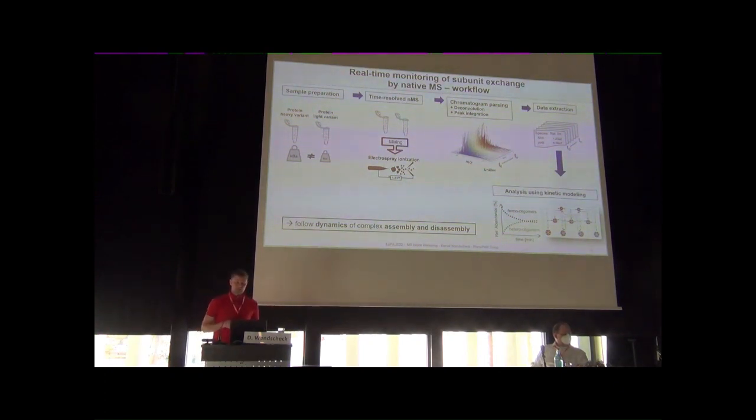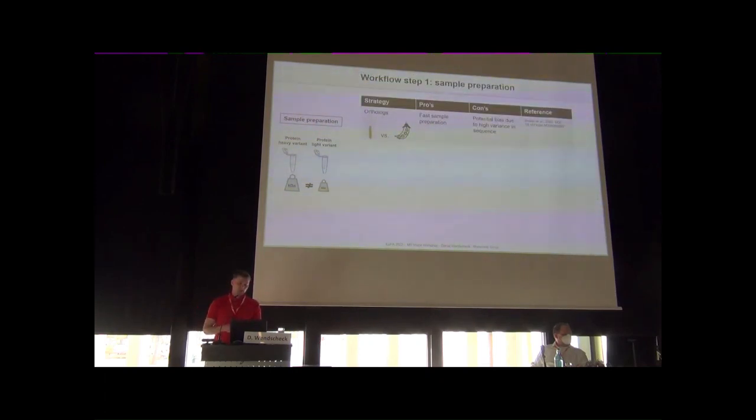So and now in the next slides, I will just guide you through this workflow. And regarding the sample preparation, there are different strategies in the field for how to generate these mass different species.